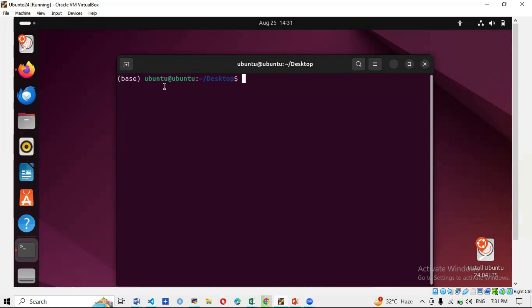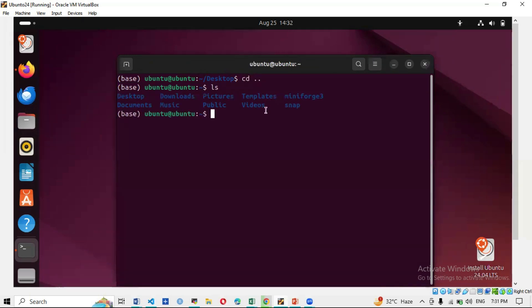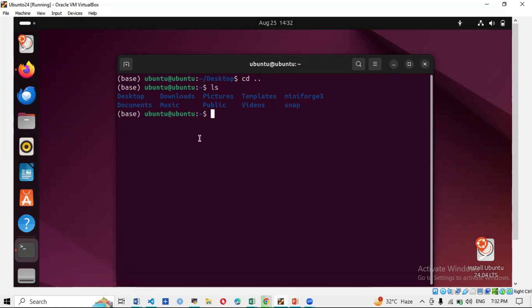Miniforge3 is now present in your system — all tools you install will be saved inside the miniforge3 folder. Now I'll explain environments. When installing a specific package, for example FastQC, you create an environment and install that tool into that specific environment. When analyzing data, you activate that environment and proceed with your analysis.